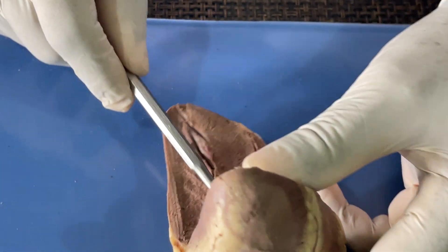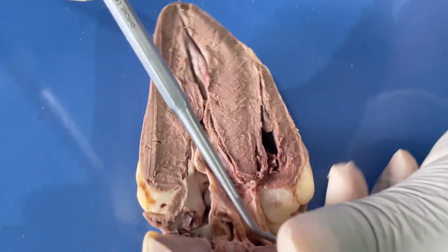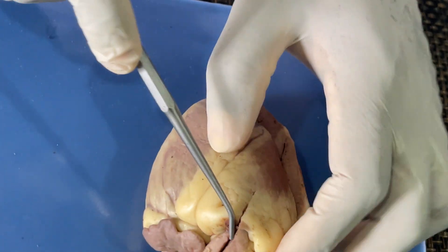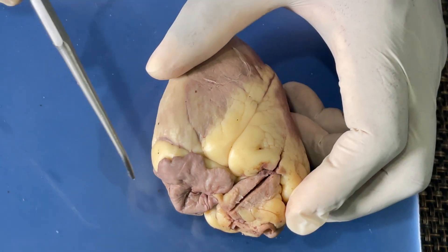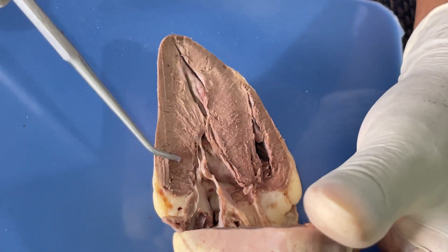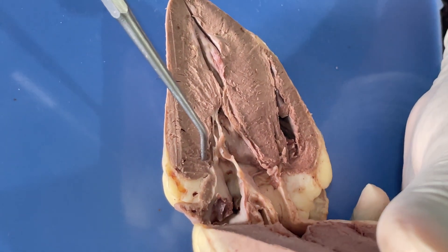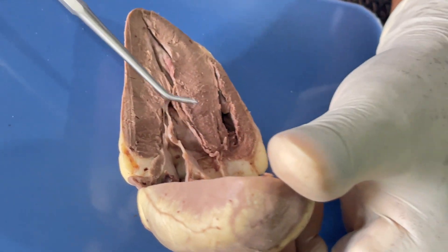Blood flows from the atrium to the ventricle, goes up, and also enters into the pulmonary trunk. It comes out there to the pulmonary arteries — the two left and right pulmonary arteries — into the lungs, and back through the pulmonary veins to the heart again. The left ventricle walls also have the epicardium, myocardium, and endocardium. Basically, these are some of the structures we have with the heart, especially the sheep heart that we use. Thank you.